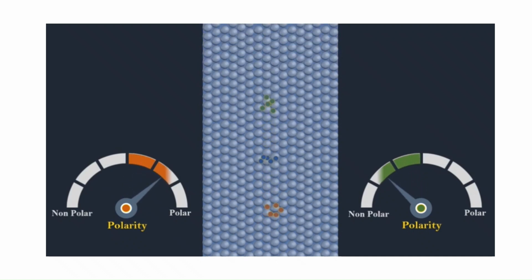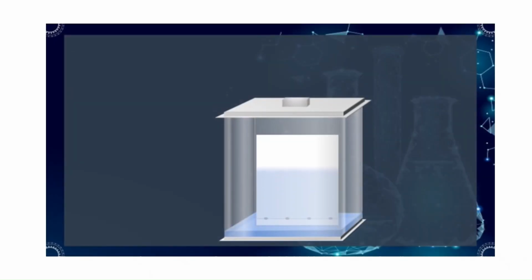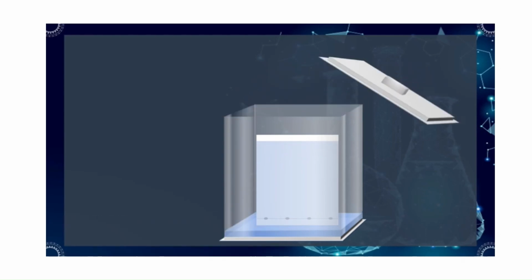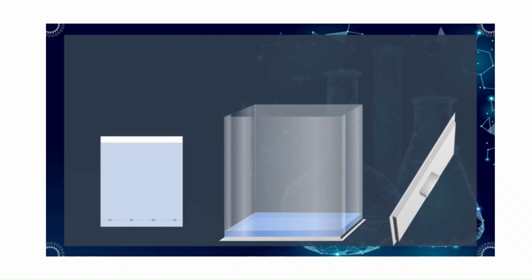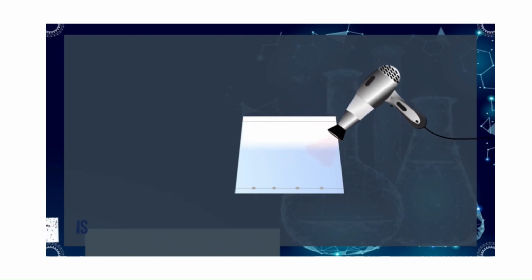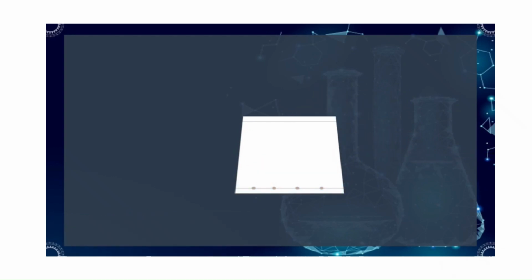So here you can see based on the polarity. And the solvent front reaches near the top of the plate, and then the plate is removed. Then drying is an important step. We have to dry completely. After drying, the plate is ready for visualization and analysis.